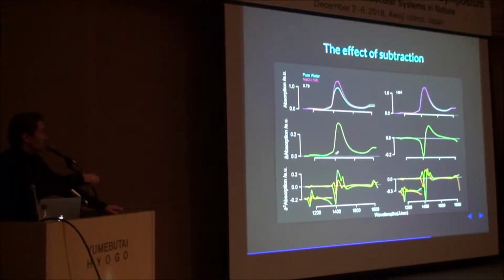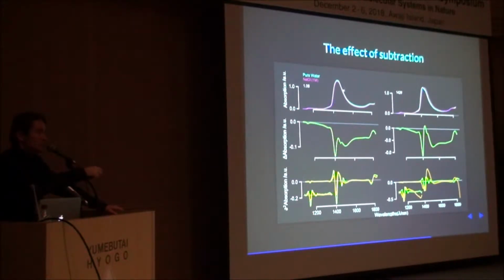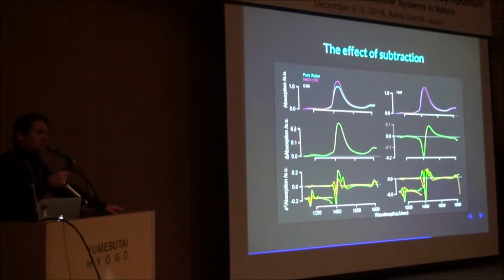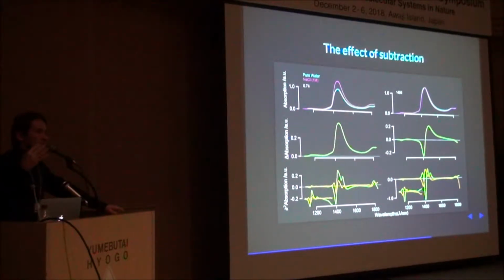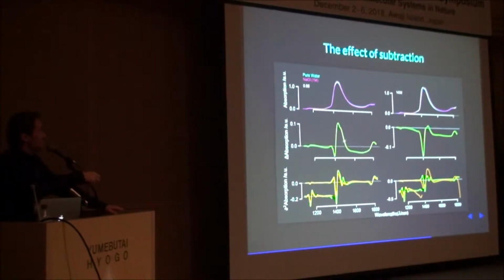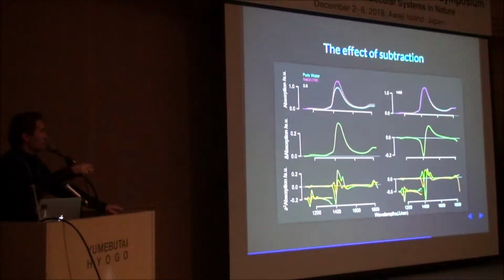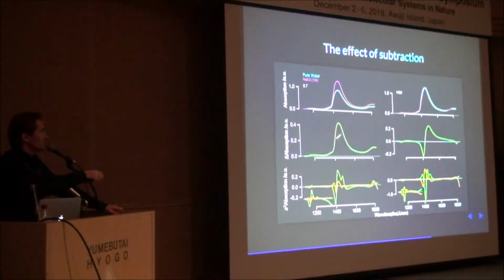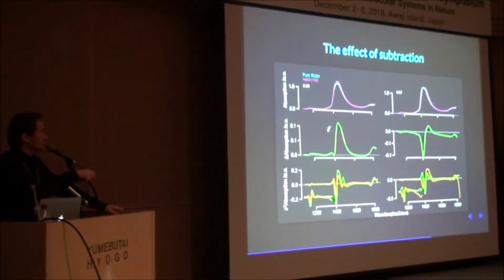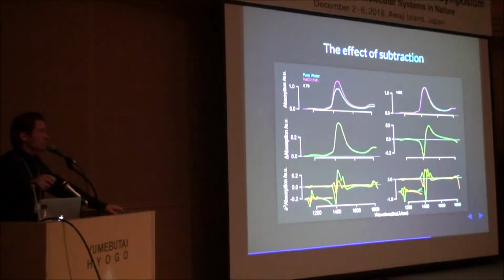And so we go from scaling from higher values to lower values. And this is the subtracted spectrum, so this is basically the magenta minus cyan. And this is what happens. You can see that as the distance between water and sample changes, the spectral pattern changes dramatically. This curve is green, but in one frame I changed the color to yellow. If you look at it, you will notice a very short yellow curve. The yellow curve is the curve with the smallest area under the curve.